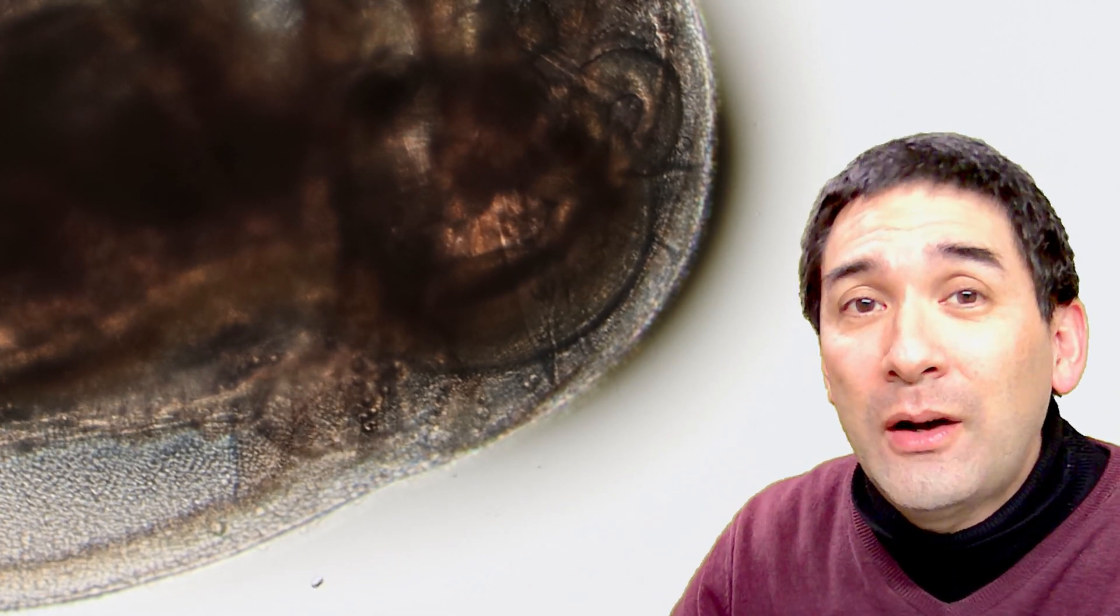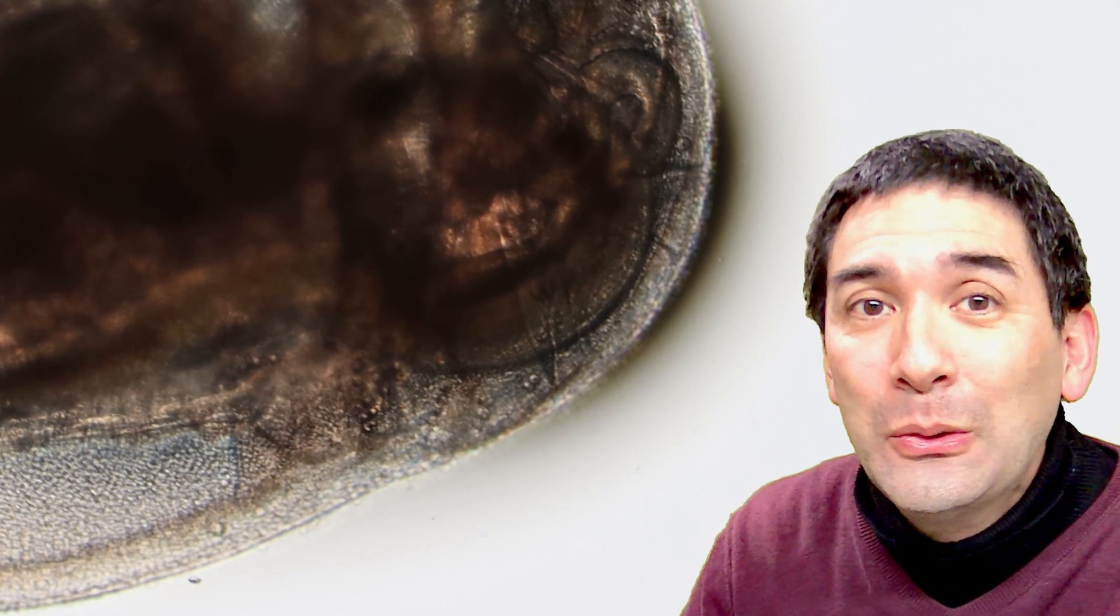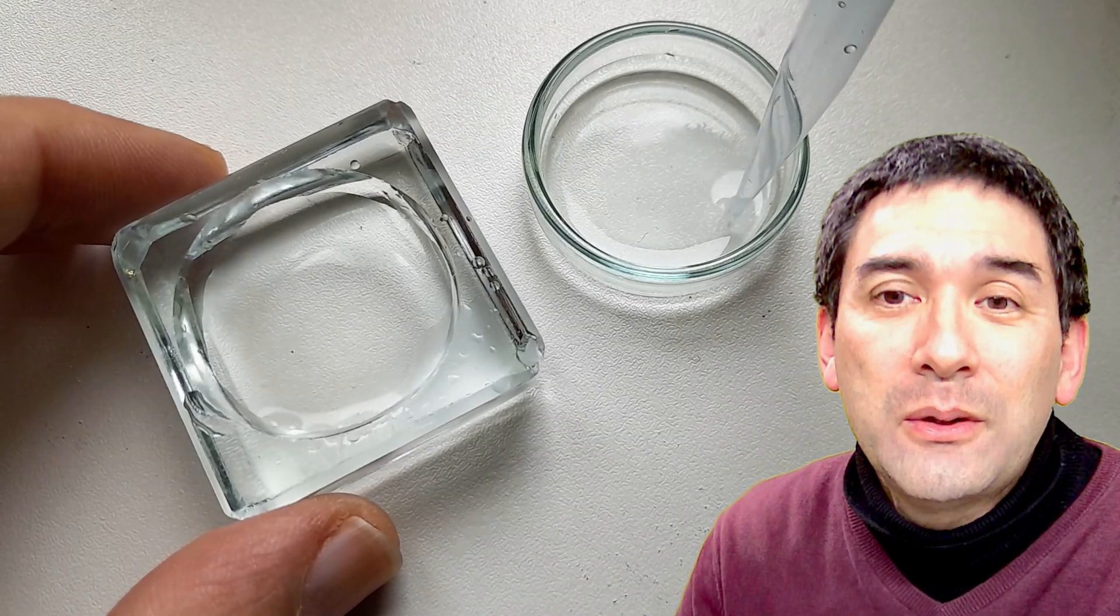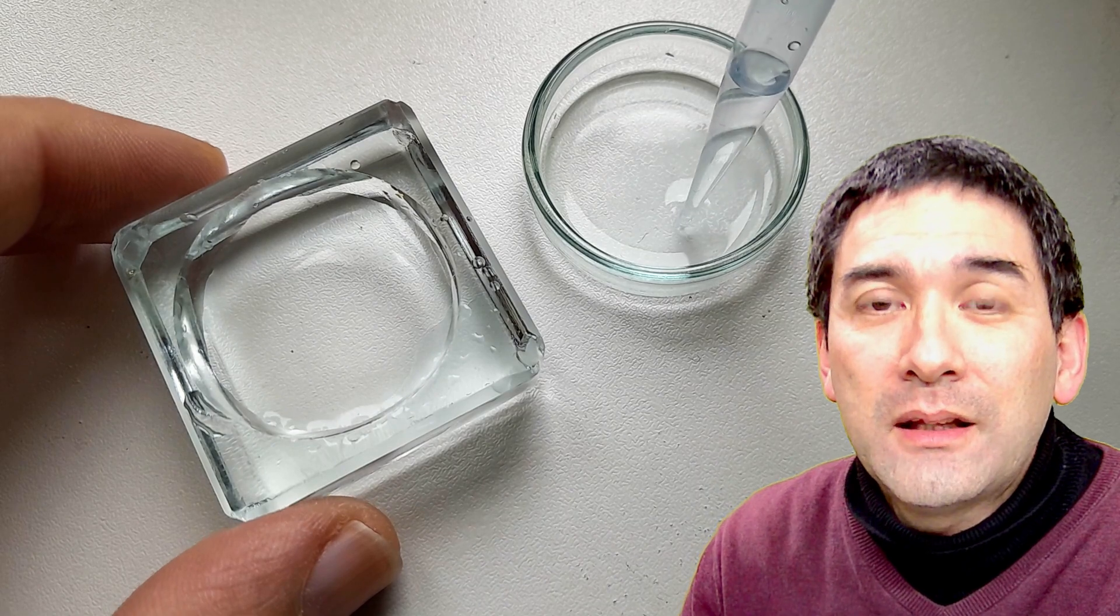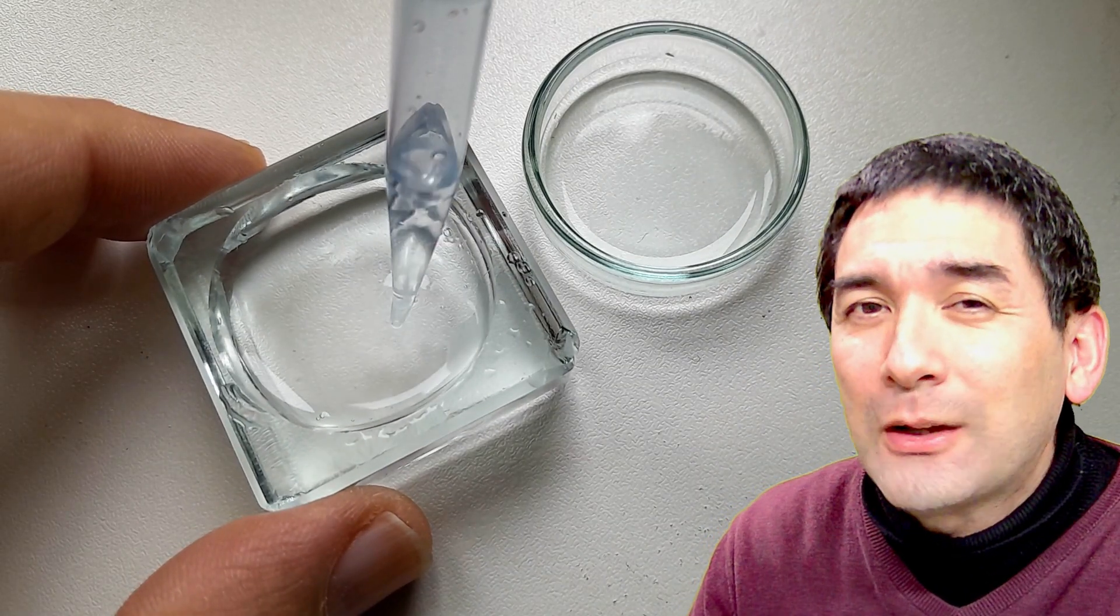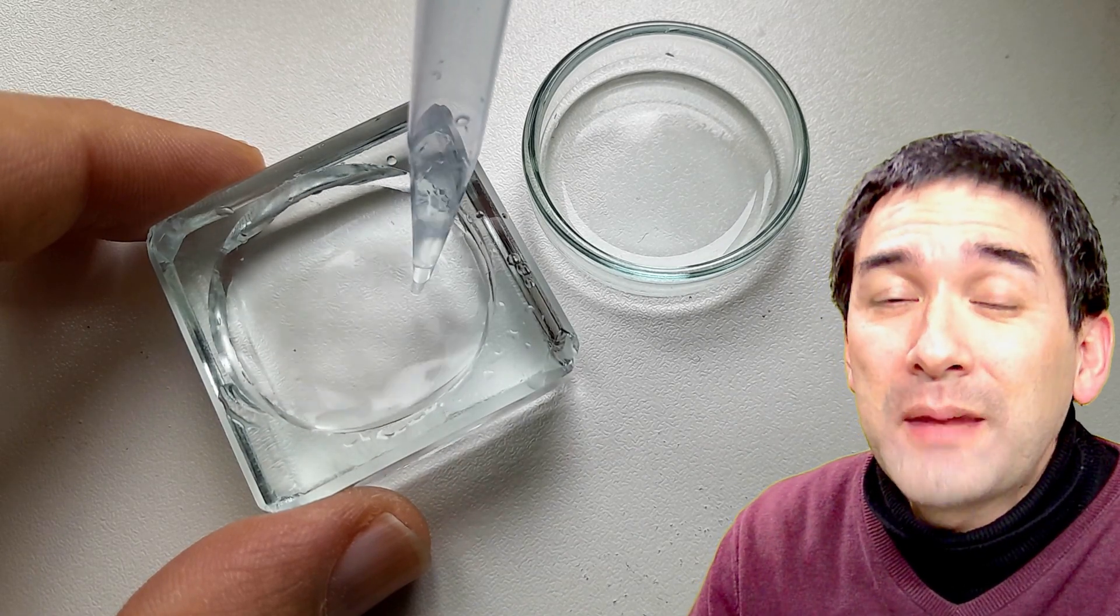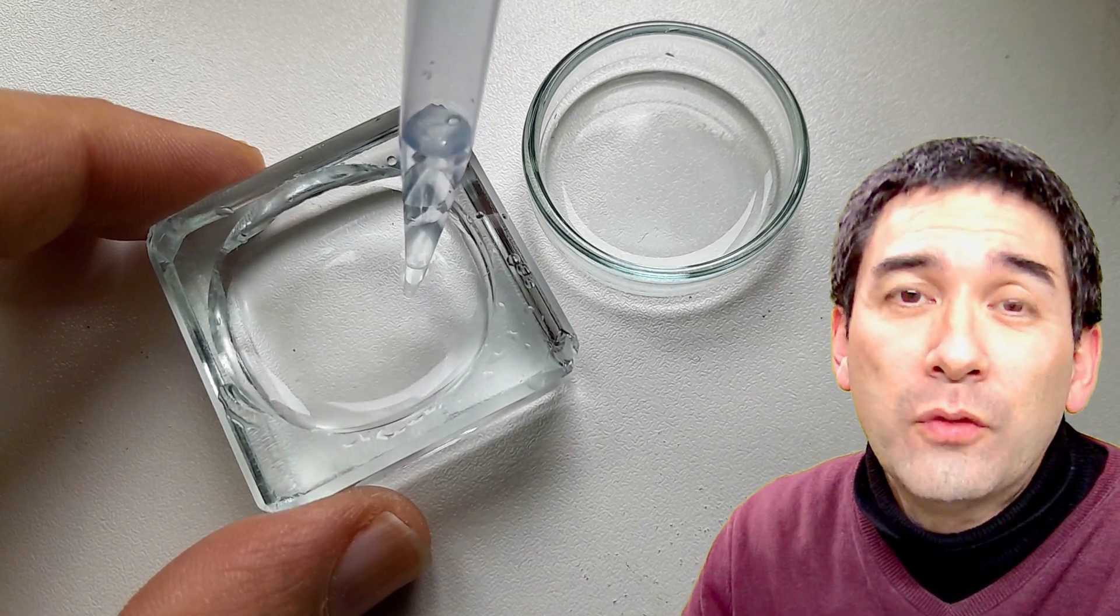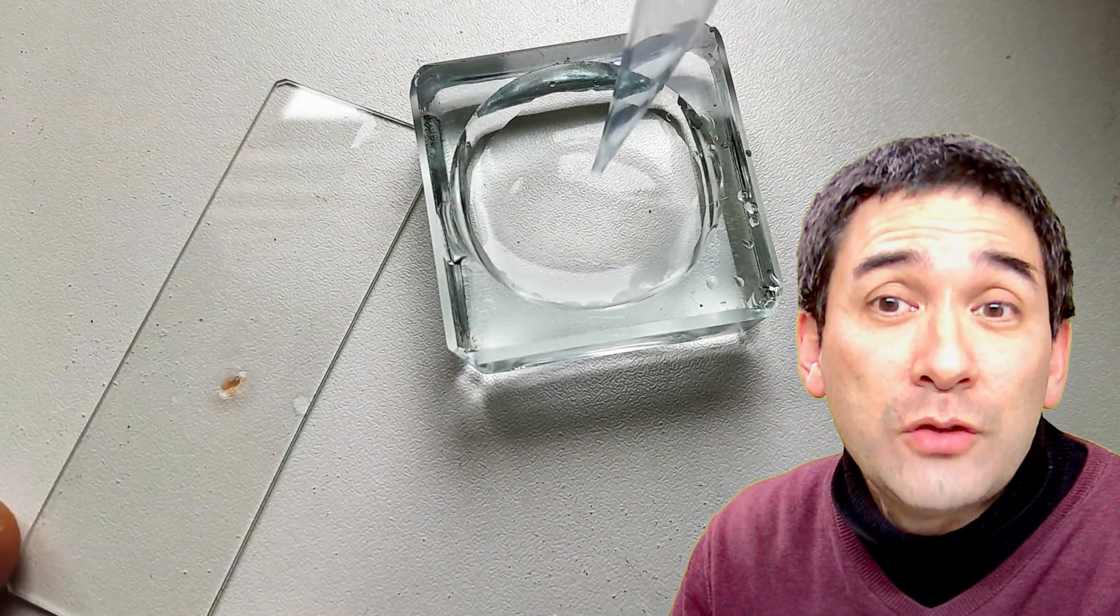Yeah, but just right now at the beginning, and the video is going to loop in just a second, we can actually see that I diluted this approximately maybe about one to ten because it was concentrated alcohol. Yeah, so maybe I'm getting around a 10% alcohol solution over here, and this was generally fine.